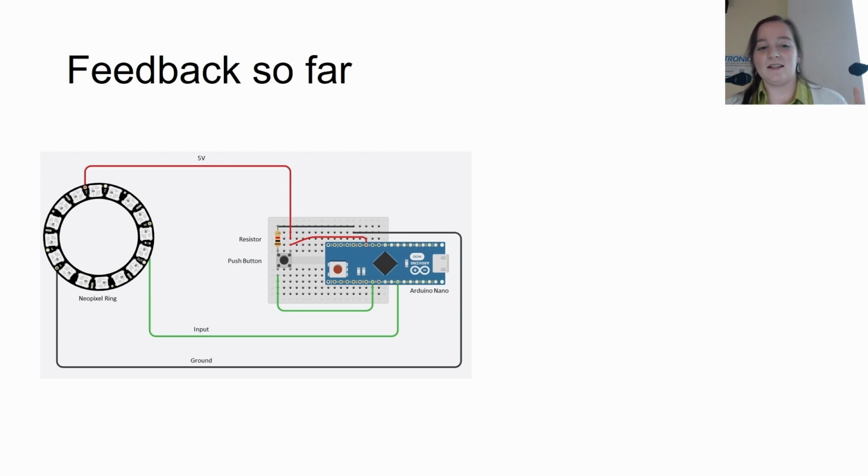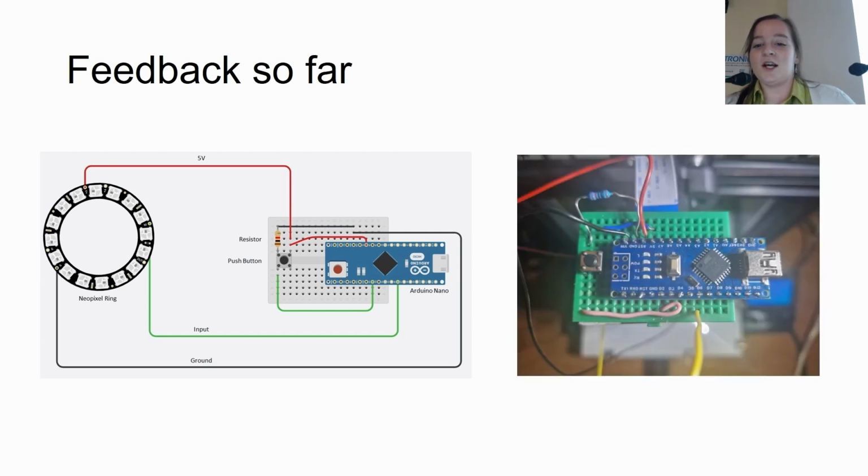So this is an example. I give them an LED ring with 3 wires, a 5-volt red wire, a black ground wire, and an input wire that's green in this image. But in the actual system that I give them a black wire, a red wire, and sometimes that input wire can be blue, green, yellow, and actually that's thrown people off, and they get very confused, and that's not something that I had anticipated, but I completely understand.